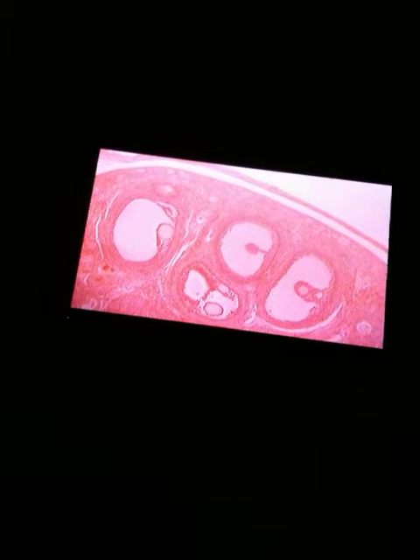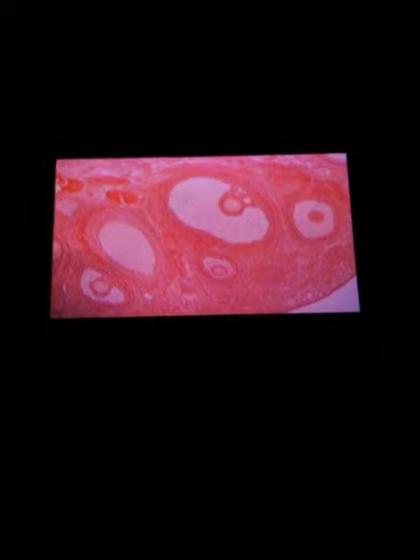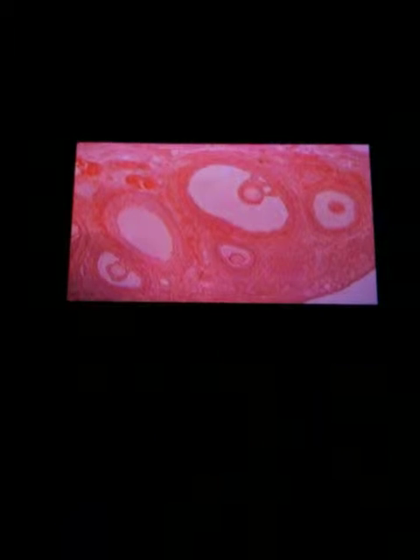All right, now, let me see. Anytime you see anything like, oh, here's a better view, actually. Oh, I know that. It's an ovary. The question would say ID organ, and you're going to say ovary because of the follicles. Now, they could ask you for different things. They could ask you to ID, what is the structure that's around here called? That's the corona radiata. Remember the corona radiata? What structure? The structure right here. So this red that goes around the oocyte is called the corona radiata.